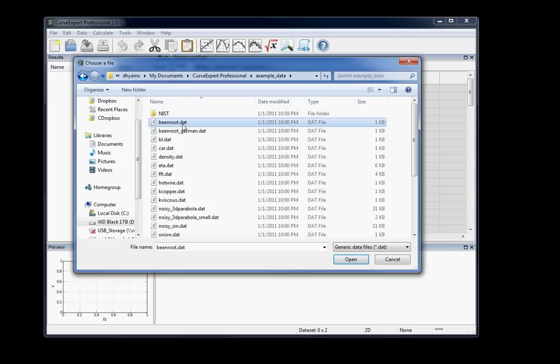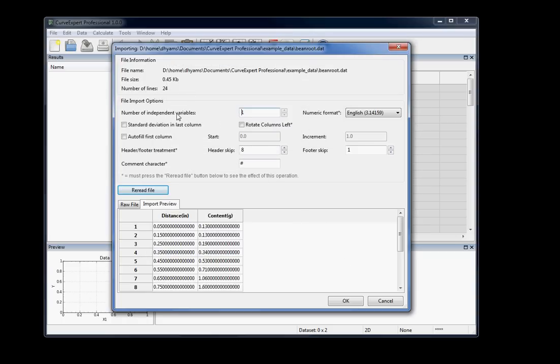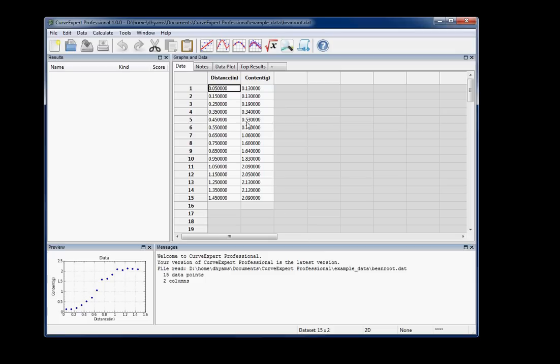Here we're just going to choose beanroot.dat, it's a good simple starter file to work with. So we'll just click Open, and for now we're just going to take the defaults in the File Import dialog, and you can see that the headers are preserved and nice things like that, and the data appears in your spreadsheet.